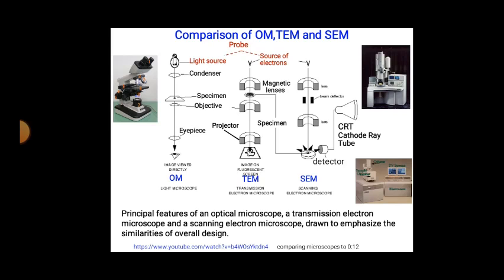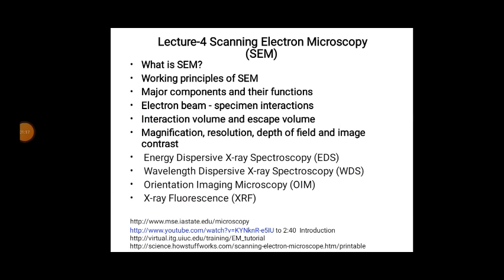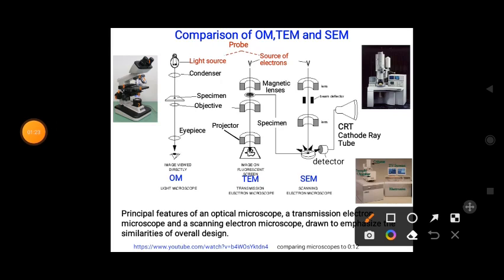Now, the resolution of the features is near 1 nanometer and the magnification capacity is up to 5 lakh x. The specimen is kept under a vacuum chamber.